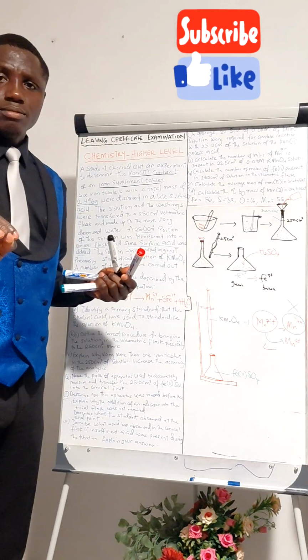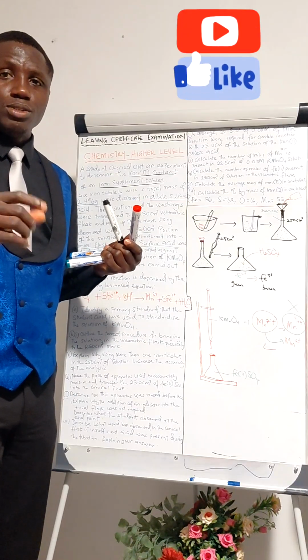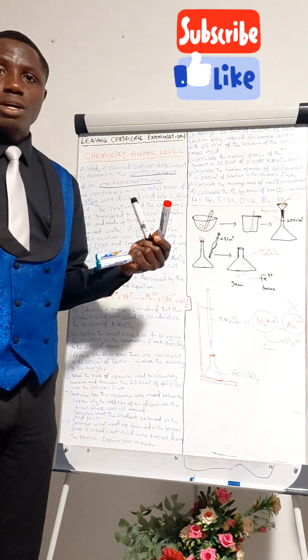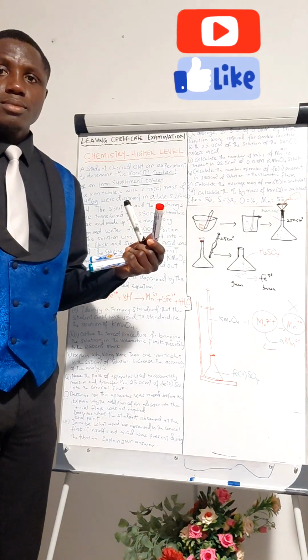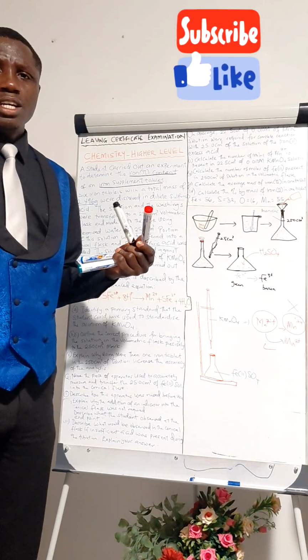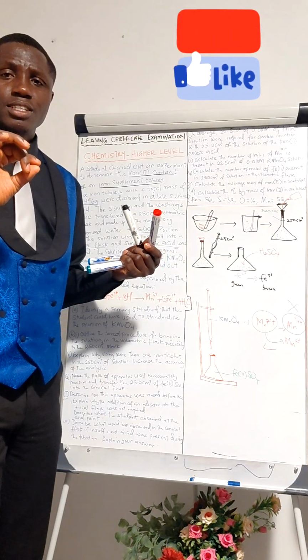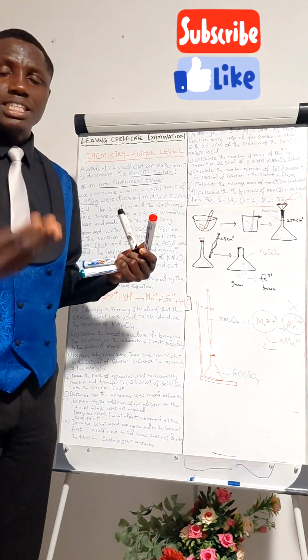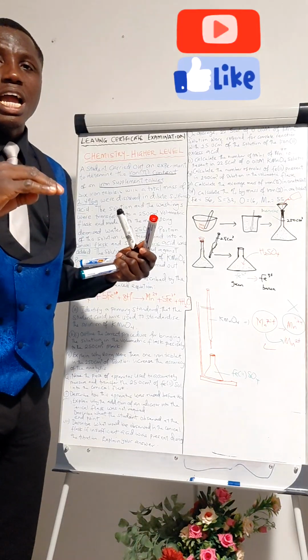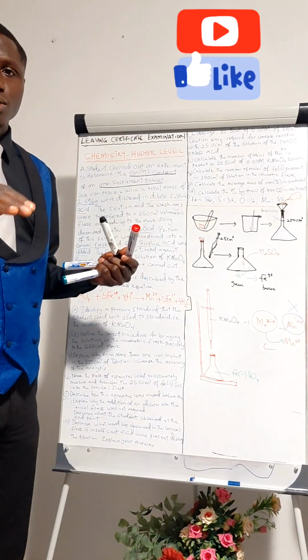Number two is that the data is better represented when you use 6 tablets, because we are using an average. You are trying to get as much analyte as possible, and using the average of the 6 tablets gives you a better representation of the analyte. It will help you to avoid random error, as you are going to be getting an average of those.